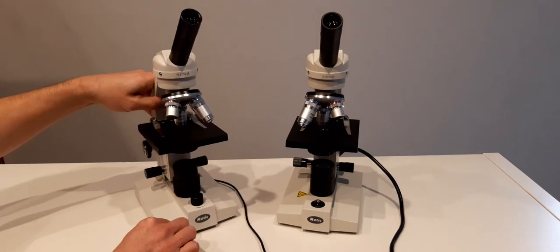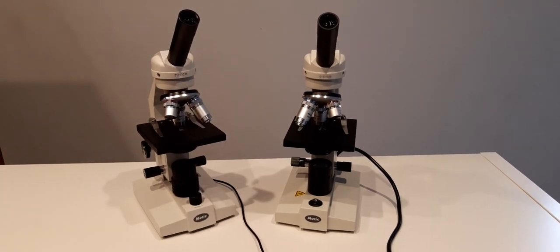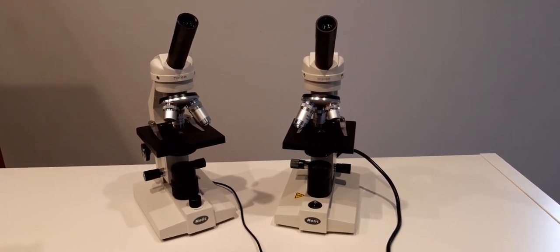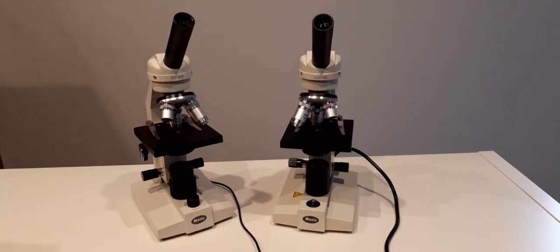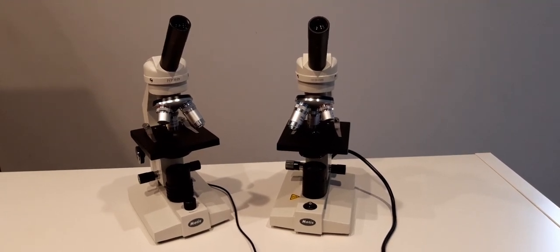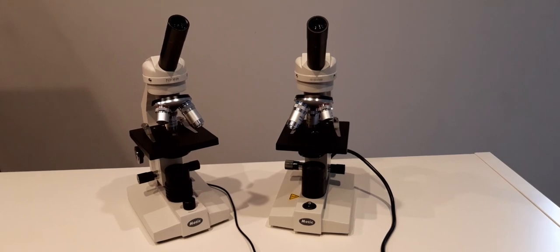The LED version is rechargeable whereas the Tungsten version uses a mains option only. There is an optional mechanical stage available to fit both.